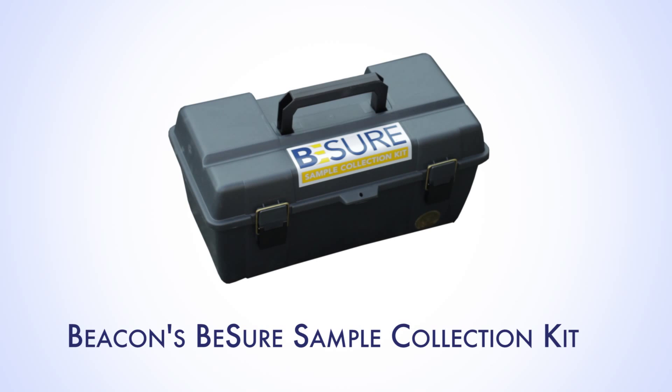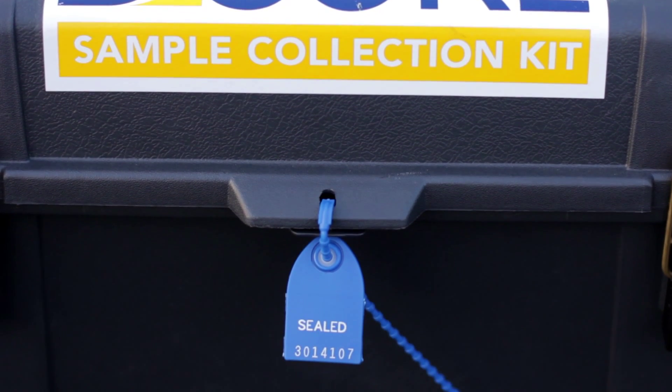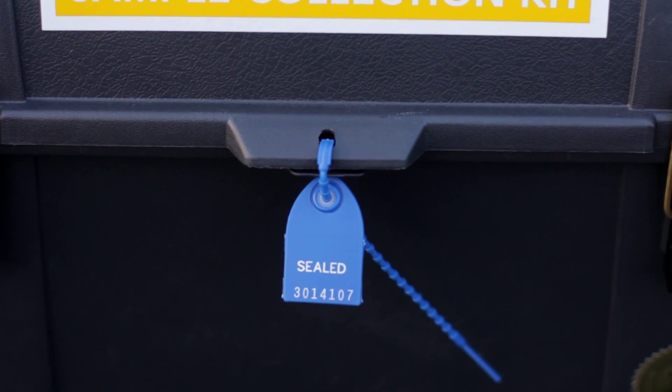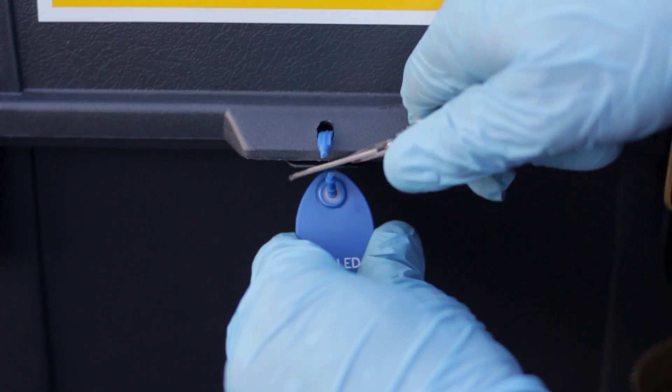Beacon's BeSure Sample Collection Kit is provided with detailed instruction for ease of sample collection. Each BeSure kit is shipped with a tug-tight custody seal. When the kit is received, verify that the seal is intact. If not, contact Beacon immediately.